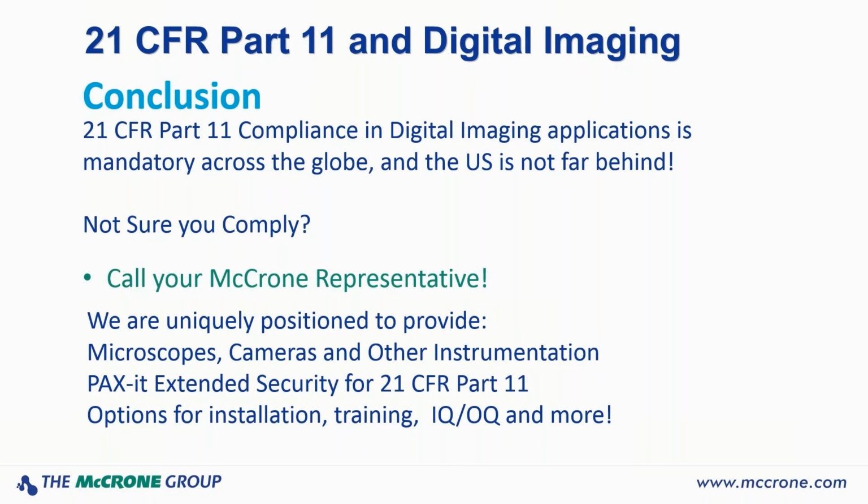In the rest of the world, compliance with 21 CFR Part 11 for FDA-regulated companies is mandatory, should those companies want to do business in the U.S. And that mandatory compliance is now upon us in the U.S. as well. If you're not sure your current lab equipment and procedures are in compliance, we can help.